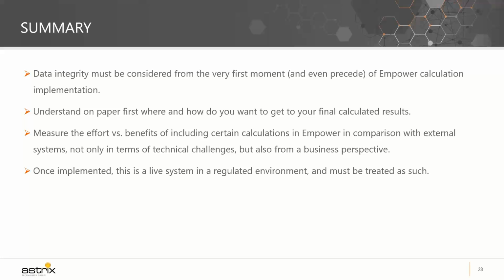And last but not least, once implemented, it is a live system in a regulated environment and must be treated as such. Once you build calculations, you test them, you validate, you create your validation documentation, and you're good to go. If changes happen to your test methods, you also have to take into consideration the calculations you built. So you don't end up with an altered method and formulas that are giving you results that are not fit for purpose anymore, and you might have issues over that, right?